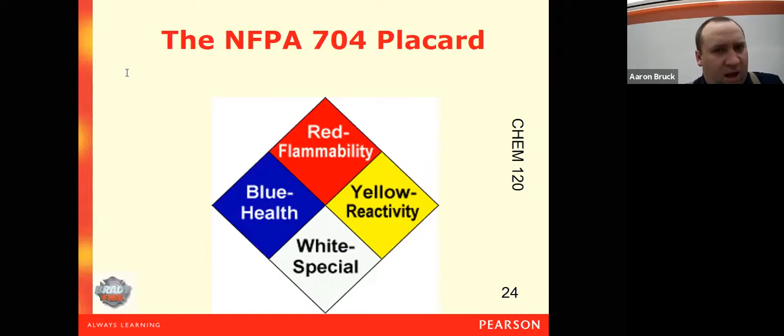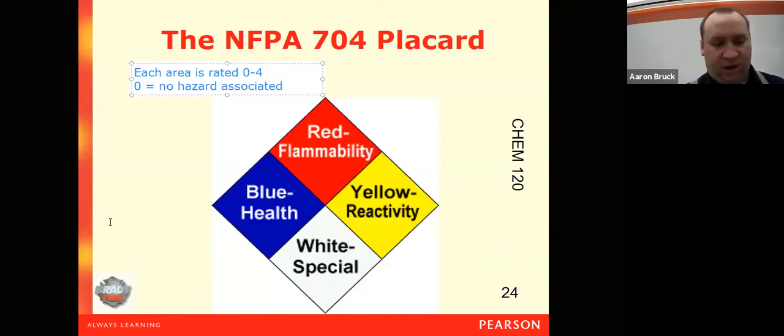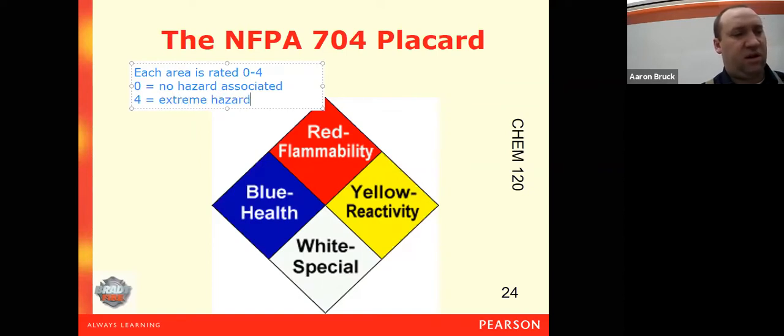If you watched the safety video in lab on Friday, you'll know from that video that each one of those areas is rated from 0 to 4. Zero is an indication that there is no hazard associated with that particular color. 4 indicates an extreme hazard of some sort. And the areas in between all are obviously in between.